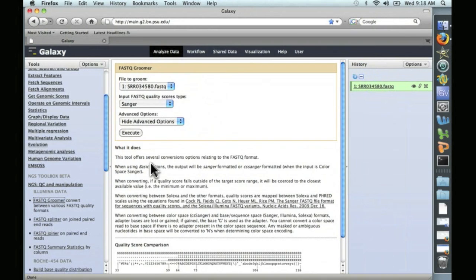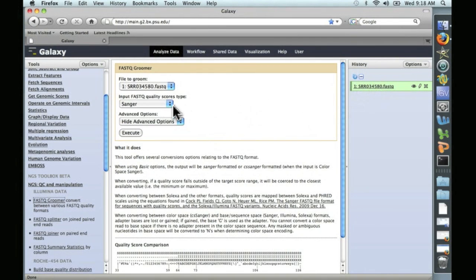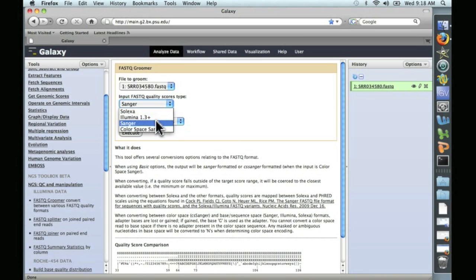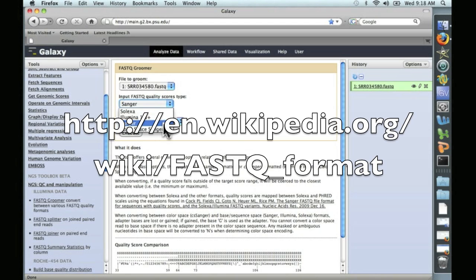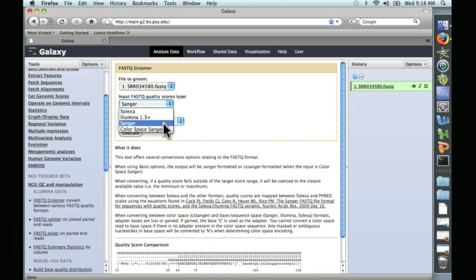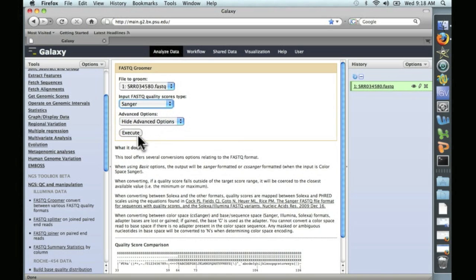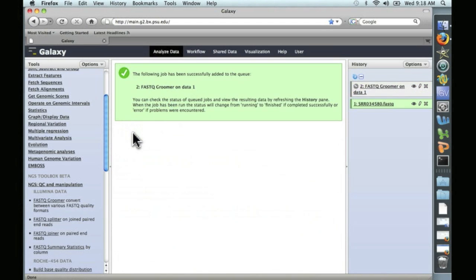The FASTQ Groomer will convert this file to the format that Galaxy needs. The thing you need to be aware of is what kind of input sequence you have. So Solexa, Illumina, Sanger, or Color Space Sanger. In our case, we have Sanger. If you're not sure, I highly recommend that you look at the Wikipedia article on FASTQ, which explains in detail how to tell from looking at your sequence what format it's in. So we'll click on Sanger. We're going to just use the default options and say Execute.